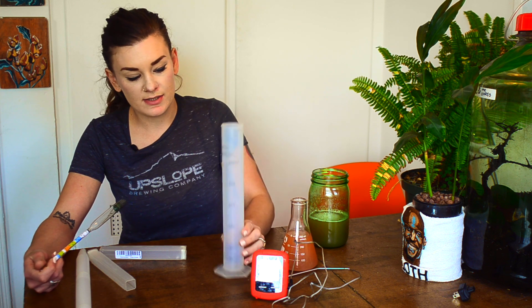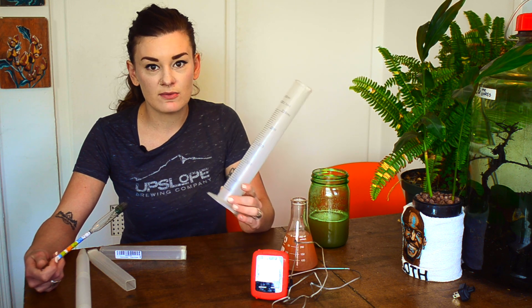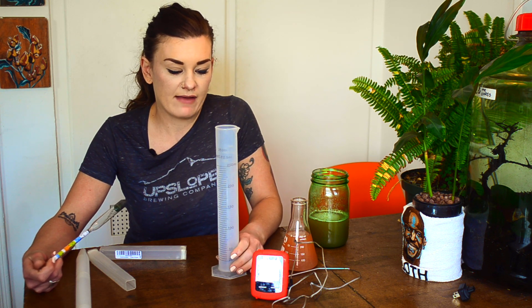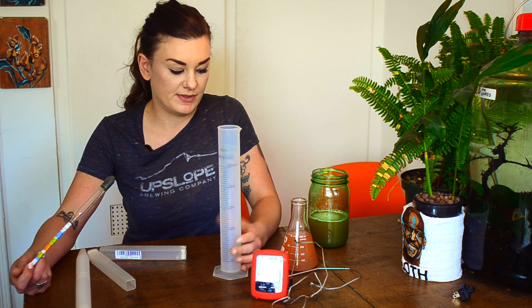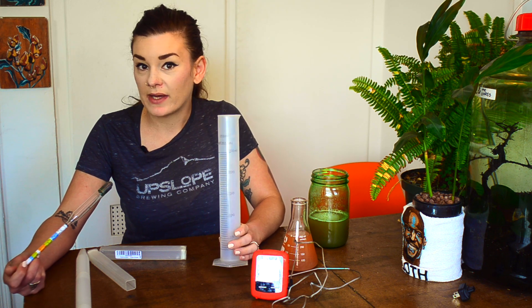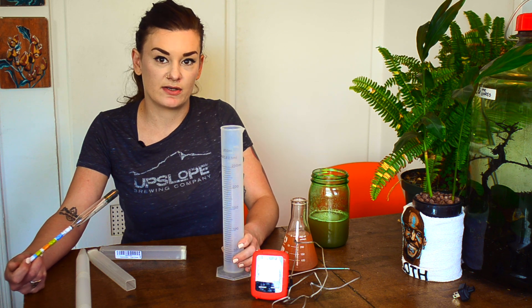I don't like hydrometers because you have to use so much liquid. If I was going to take like five readings, it's basically an entire beer you're losing — like five glasses of beer I'm not drinking. That's why I'm going to show you how to use a refractometer, because the sample size is significantly less.